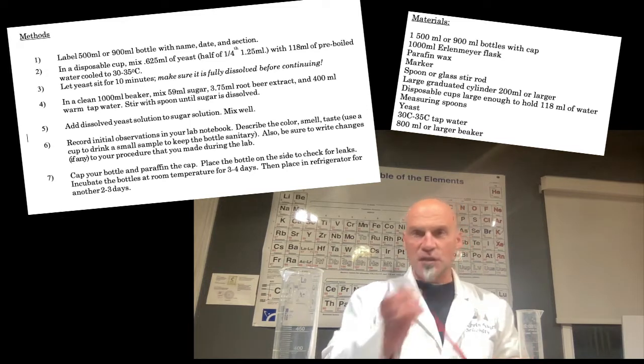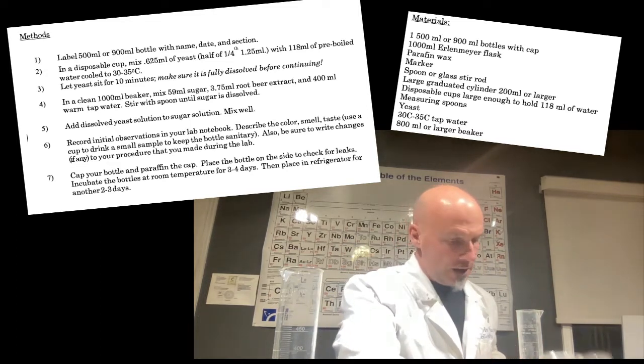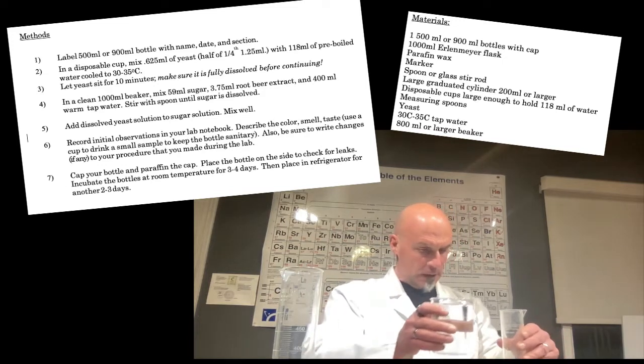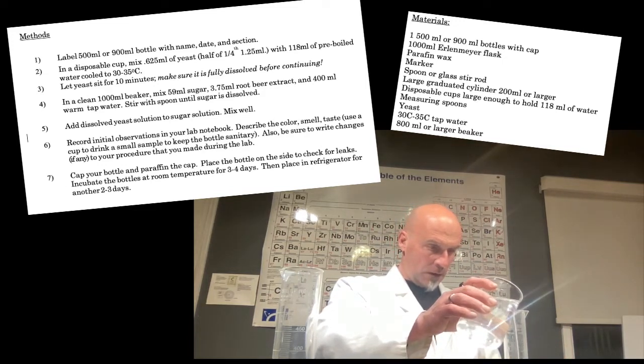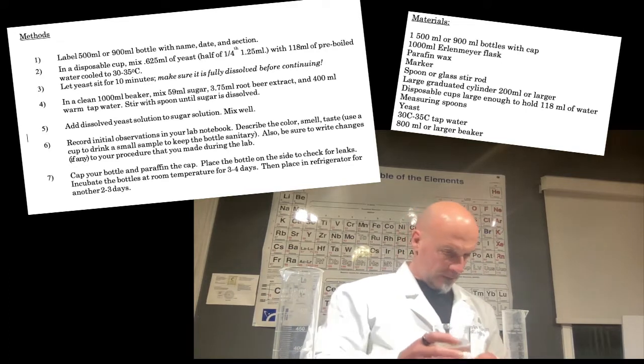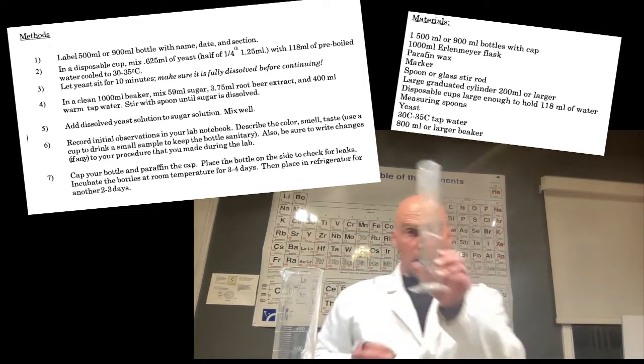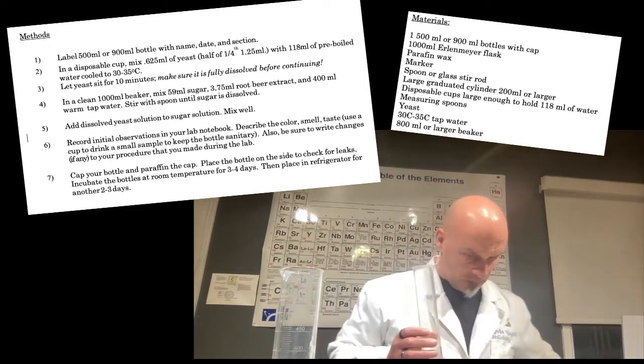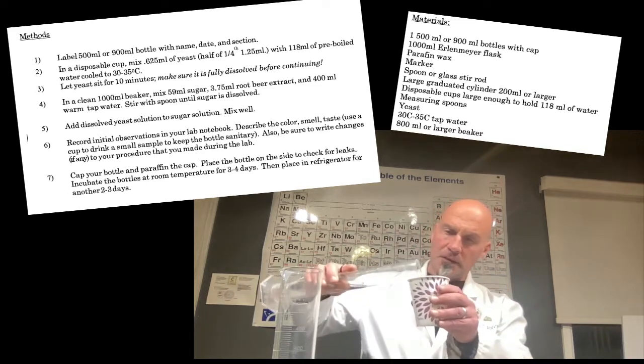And then, we're going to go ahead and add 118 milliliters of water. Okay, let's make sure we're good. Look at that, it's amazing, it's just perfect. Who knew, just absolutely incredible. Alright, so we're going to measure 118 milliliters of water. Again, make sure the graduated cylinder is flat on the lab table. Nice, accurate measurement. Okay, there's my 118 milliliters.